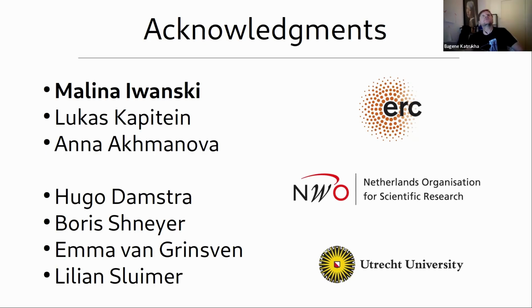Not that I'm aware of. You mean deskewing on the fly? I think it's not possible. You need to create an extra new file, right? Which would be large. Can you take the data and deskew it and work with it in Zen, or do you have to take it out and use these third-party platforms?